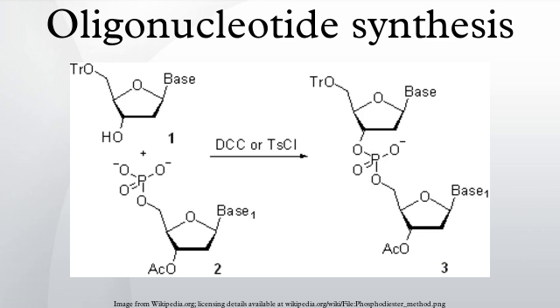The 3'-terminal hydroxy group in oligonucleotides synthesized on nucleosidic solid supports is deprotected under conditions somewhat milder than those applicable for universal solid supports. However, the fact that a nucleosidic solid support has to be selected in a sequence-specific manner reduces the throughput of the entire synthetic process and increases the likelihood of human error.